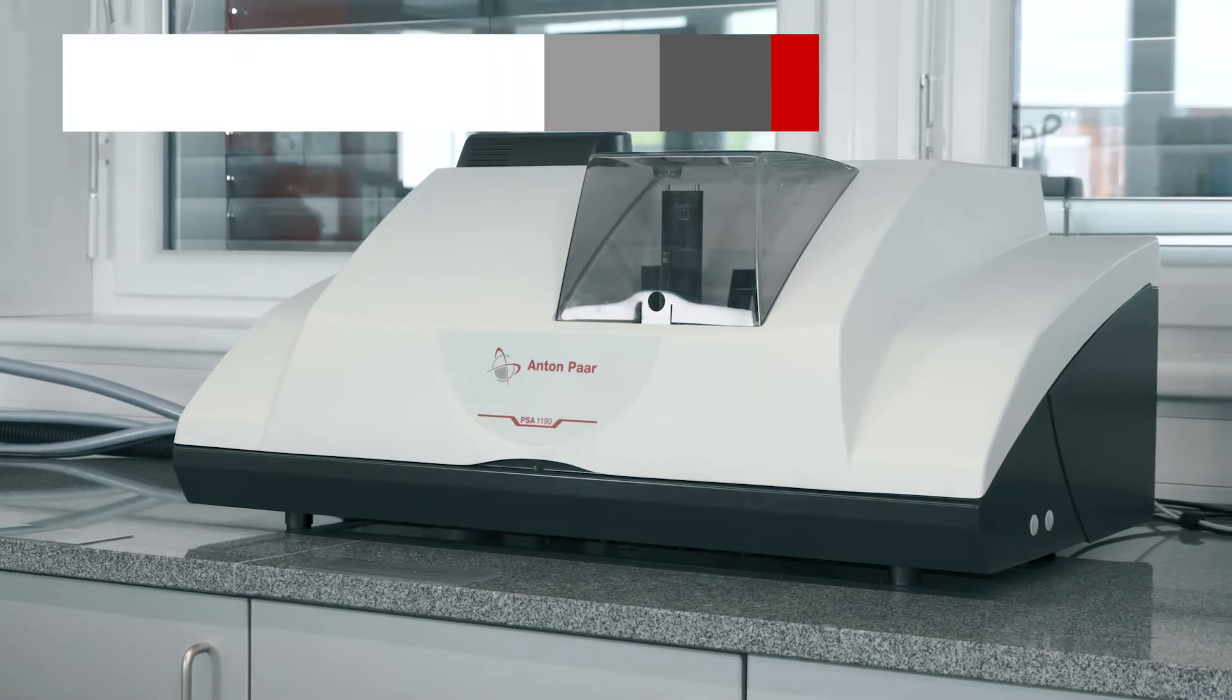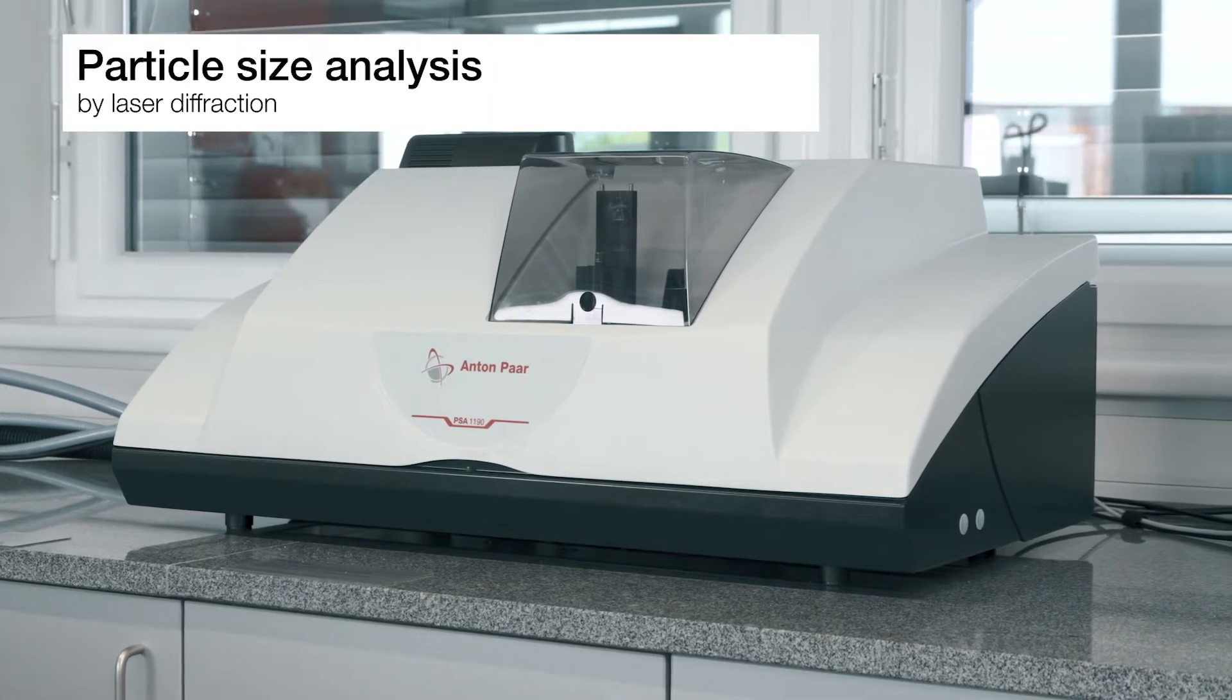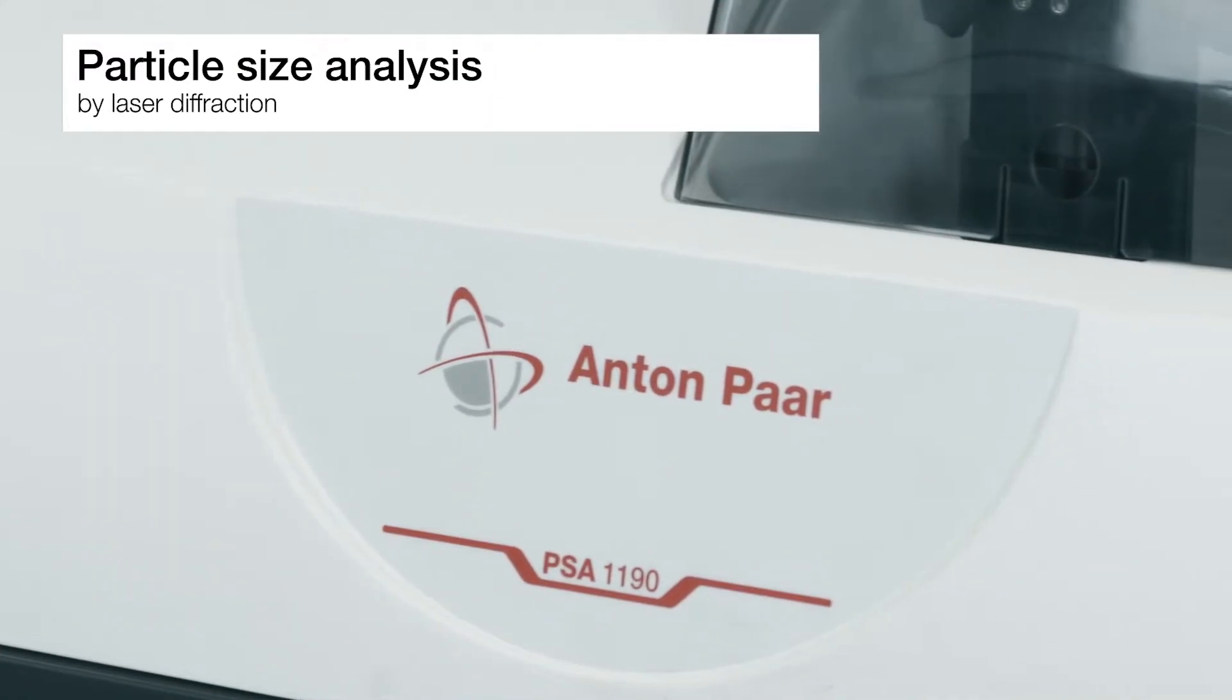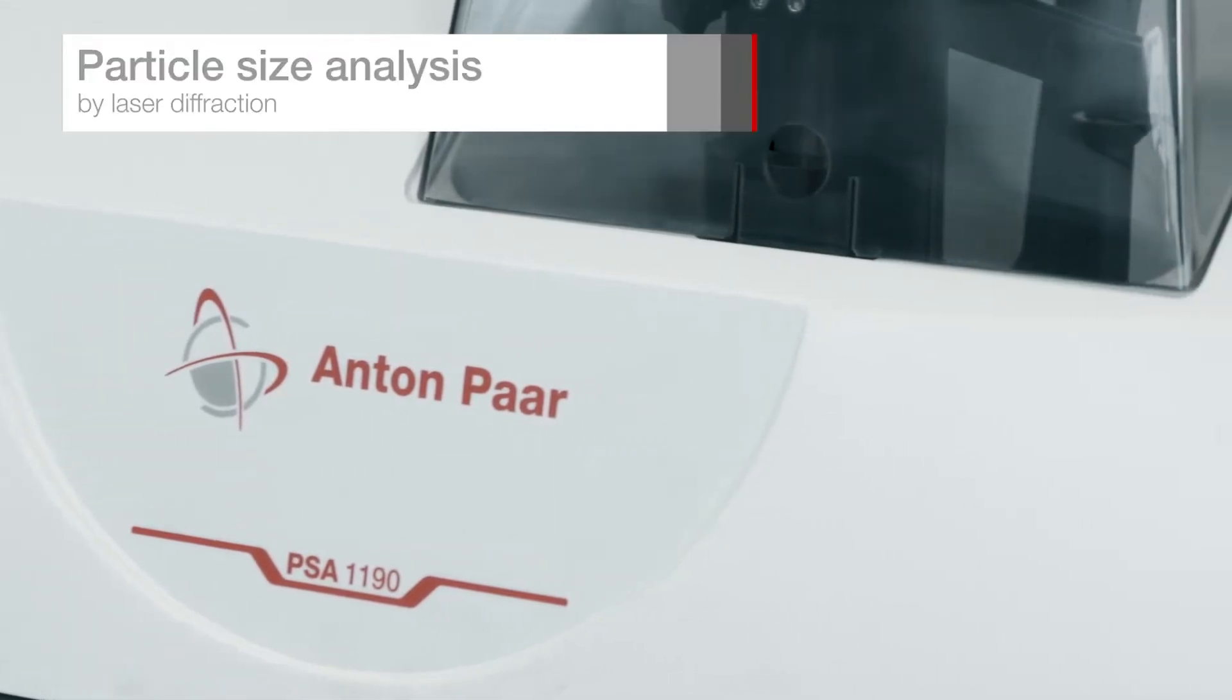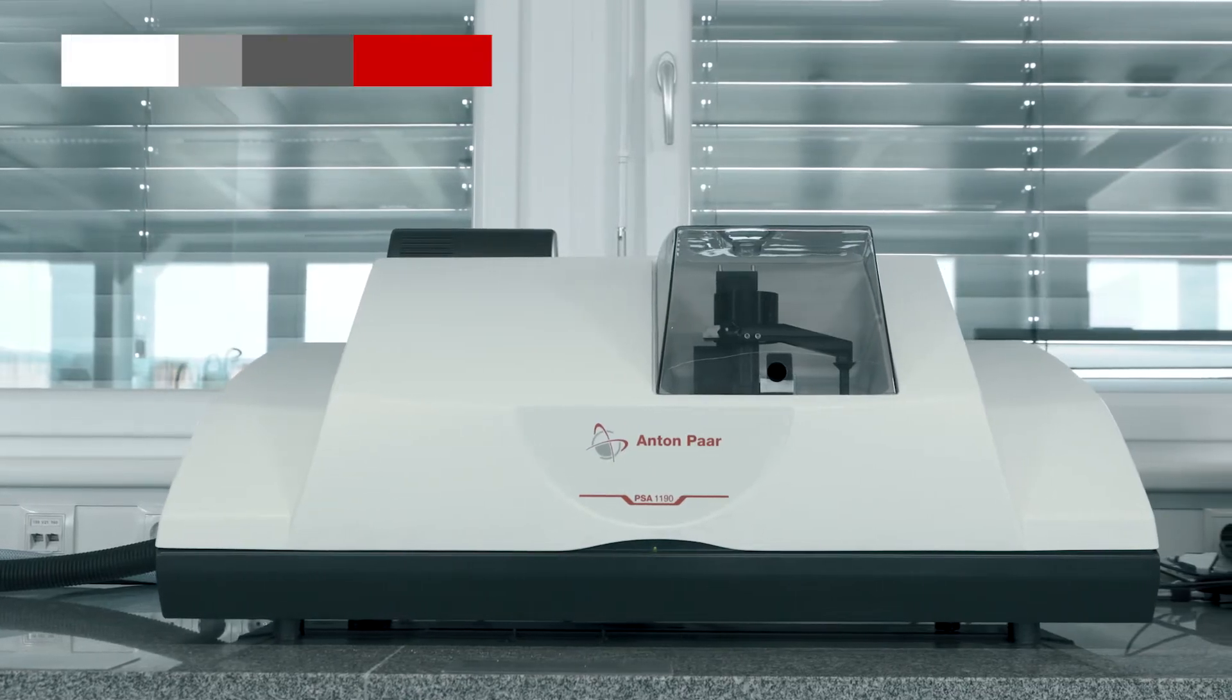PSA is a particle size analyzer based on laser diffraction technology. It provides accurate and repeatable analysis in the range of 40 nanometers to 2.5 millimeters.